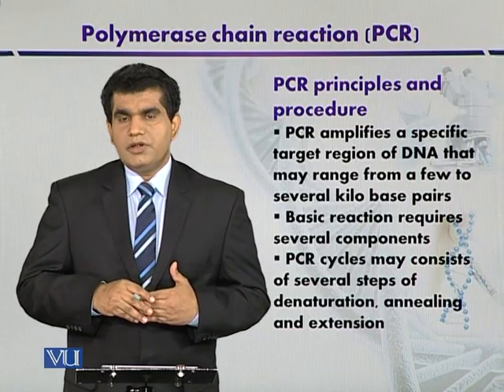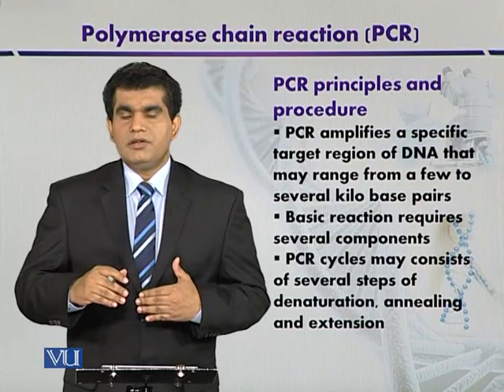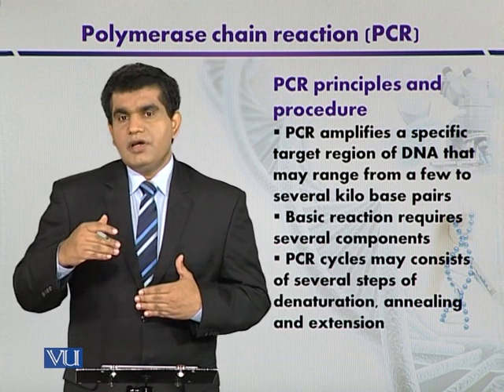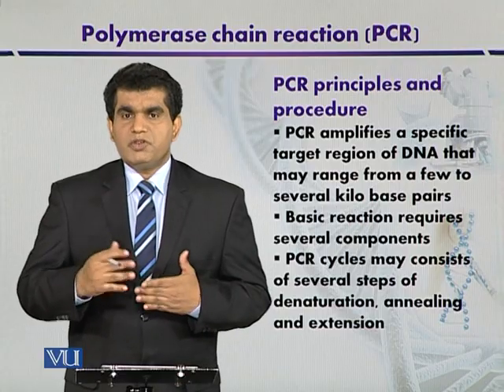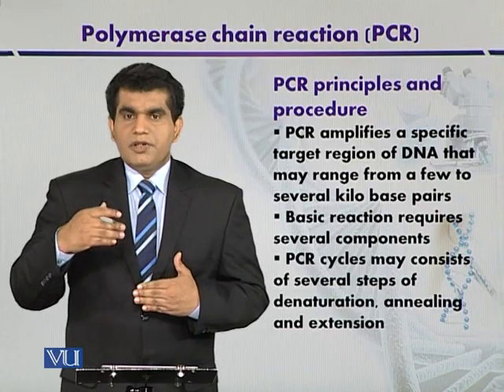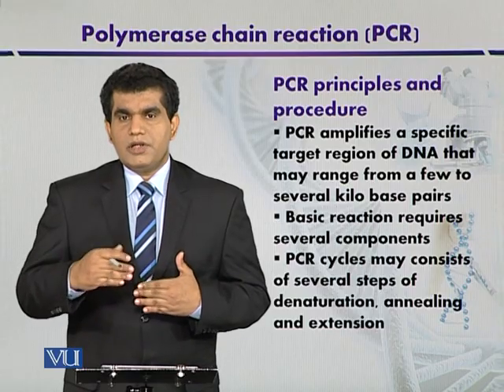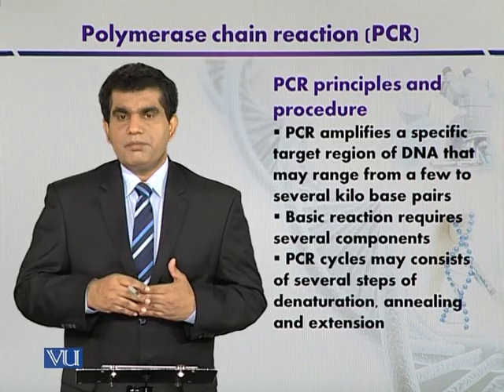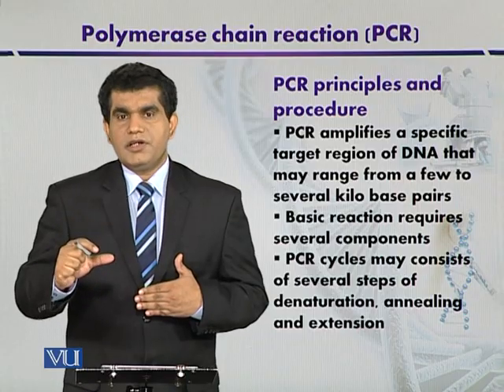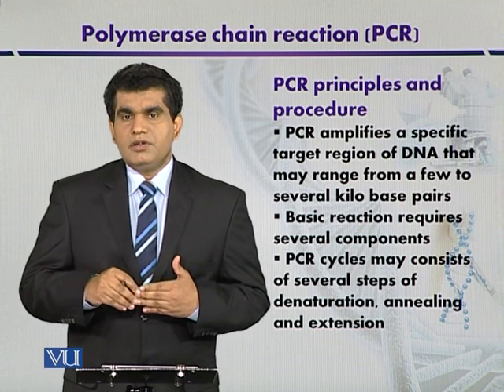After its conversion into single-stranded form, the next major step in PCR after denaturation is the annealing of the primer. This annealing step is carried out at a relatively low temperature, like between 50 to 65 degrees Celsius. और इसमें हम ये ख्याल रखते हैं कि annealing temperature कम से कम 5 डिग्री सेल्सियस low होना चाहिए than the melting temperature of the primer. तो primer अपने complementary sequence से bind करता है on the target DNA, and then with the help of DNA polymerase, it can cause the extension of the DNA in the next step.